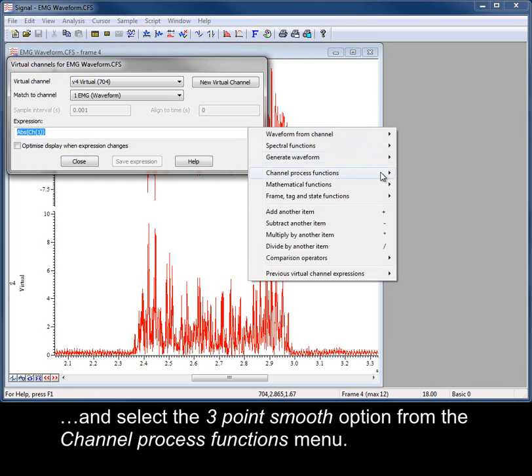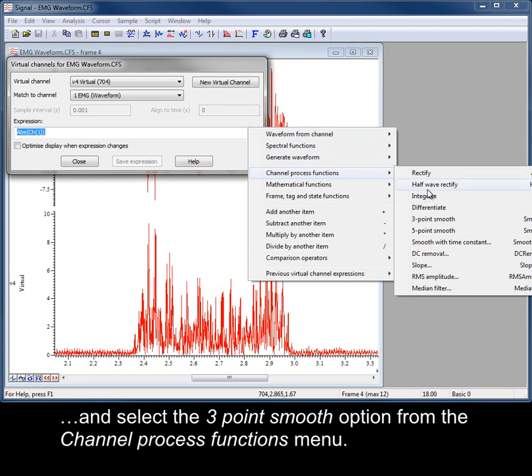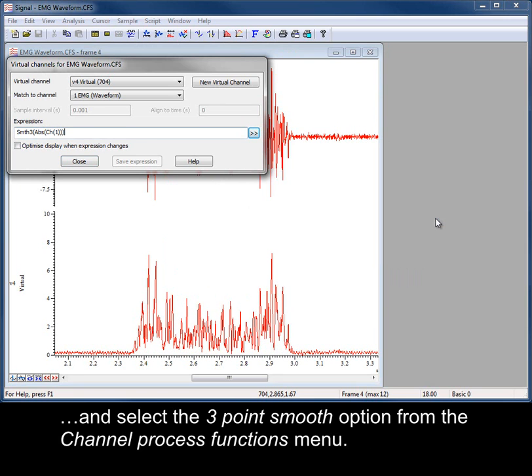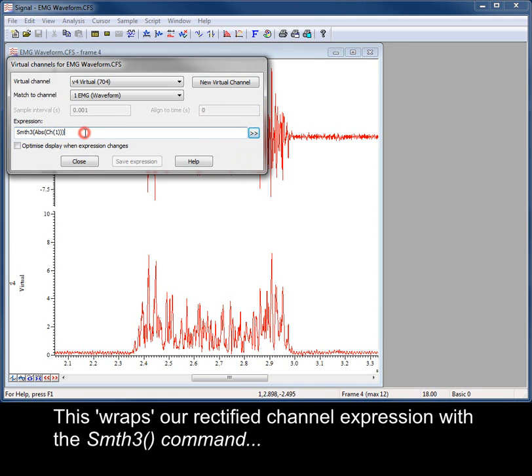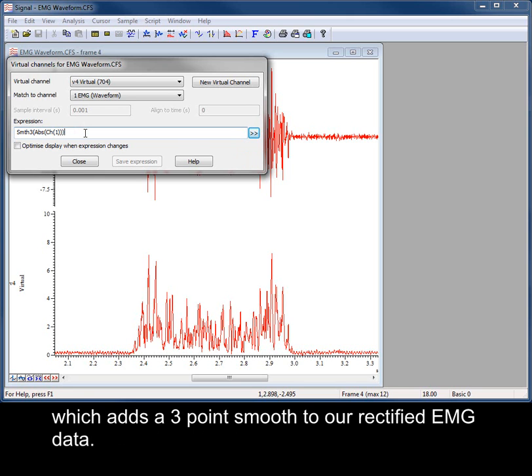And select the three-point smooth option from the channel process functions menu. This wraps our rectified channel expression with the smooth 3 command, which adds a three-point smooth to our rectified EMG data.